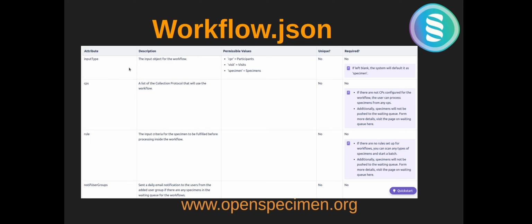Now the next components are the CPs and the rules. Based on these two components, CPs and rules, the waiting queue of the workflow is triggered. In the CPs component, we define the list of the collection protocols that we want to use for the workflow. If we do not define any collection protocol, then the workflow can be used for all the collection protocols in OpenSpecimen.